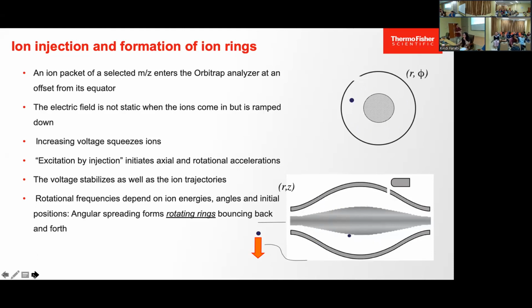Then it will form something like this. For example, if I want to monitor 100,000 resolution, the time required is 256 milliseconds. It's in milliseconds, not 1 second.